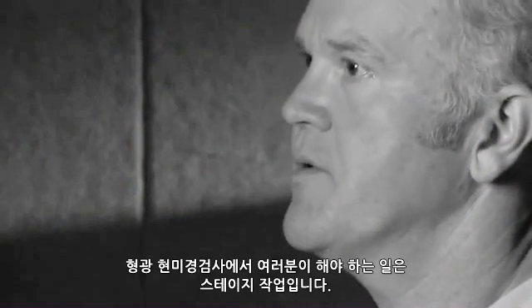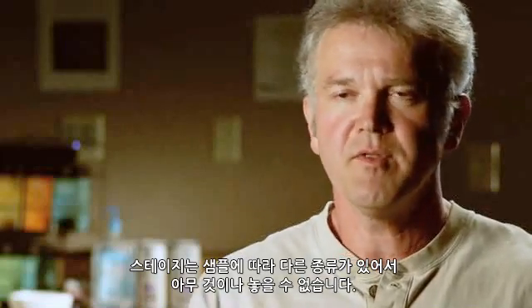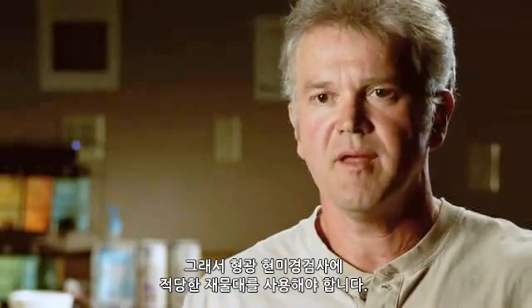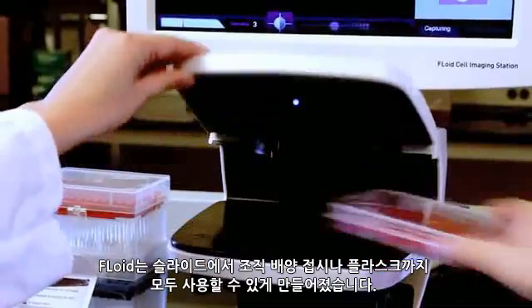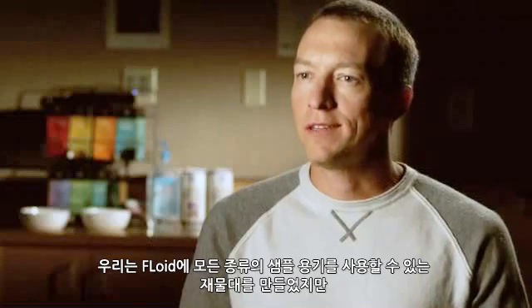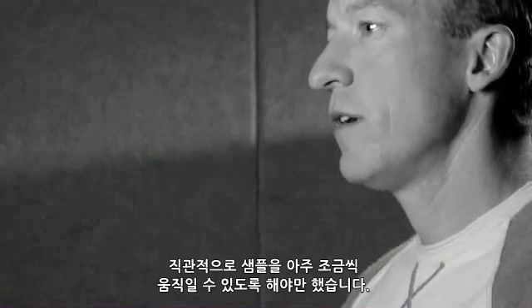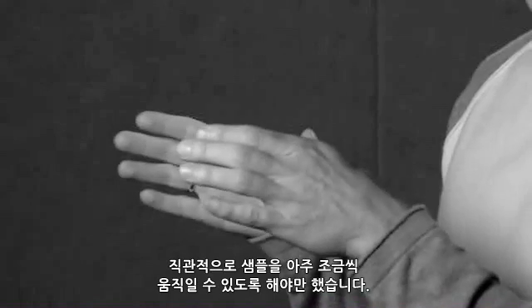Something you have to work around on fluorescence microscopes is the stage. They either have inserts or they won't accept everything you bring to them — you have to place the sample in something compatible with the microscope. With FLoid, it was built to take everything from slides to tissue culture discs to flasks. Anything you can put on there is going to work with FLoid. We made the stage on FLoid to accommodate all types of sample vessels and also allow you to very intuitively move your sample around in very small motions.